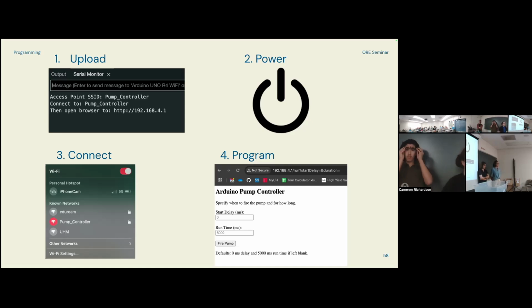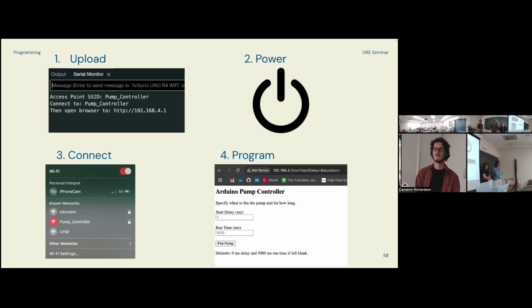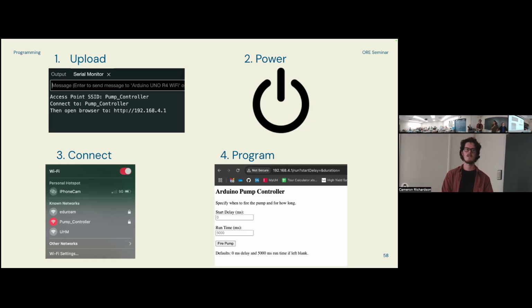What's the max range of the Wi-Fi, in case you throw it off a boat? We were initially skeptical that you could even connect to it when it's submerged in inches of water, and it worked. We haven't tested it in salt water, which could be more complicated. There's a lot more electrical connectivity that might interfere with it, but honestly, I don't know.